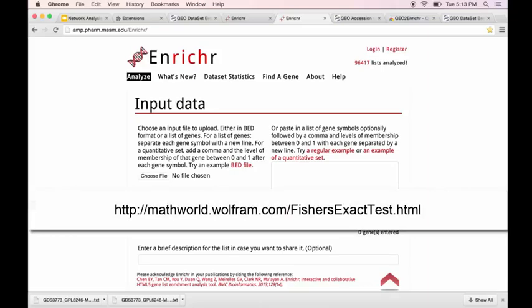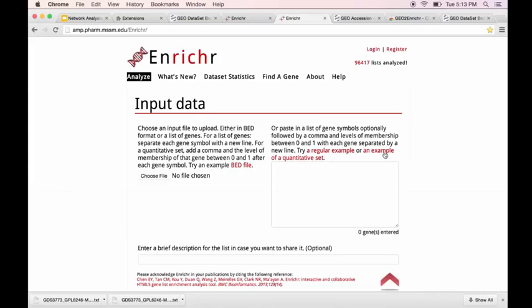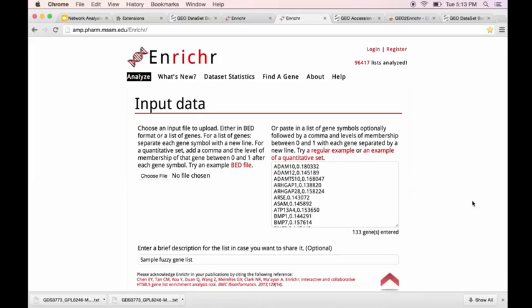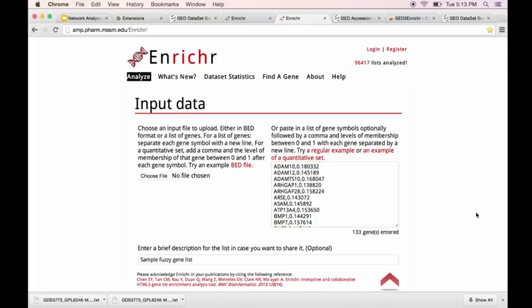So let's look at an example. So on the UI, it actually has this button to click, an example of a quantitative set. And here you see a list of genes, comma-separated, with a membership value. And so this is called a fuzzy set. So with a crisp set, an element is either in the set or it's not in the set. With a fuzzy set, there's a statistical likelihood that it is in the set. And so here you see the ADAM10 has a membership value of 0.180332.